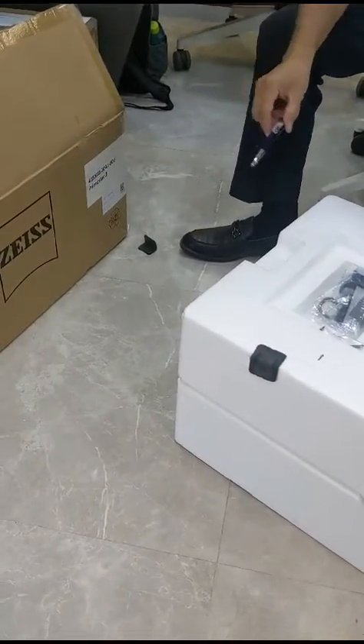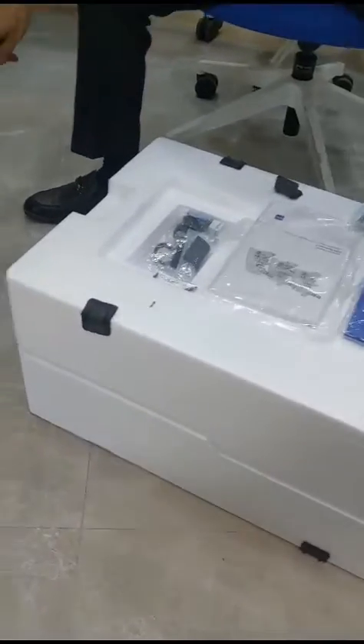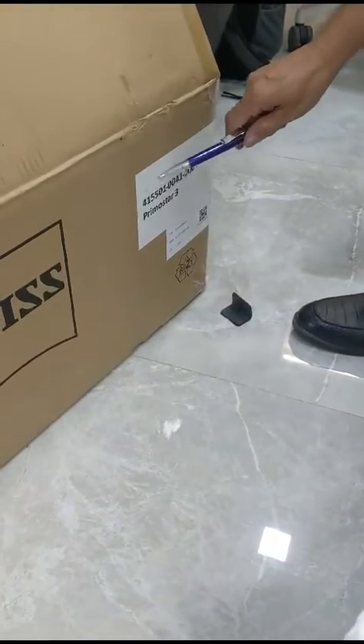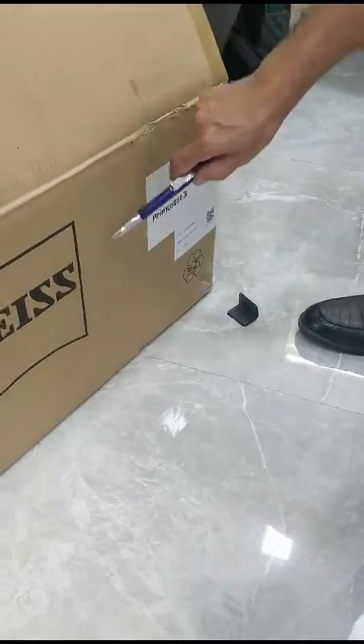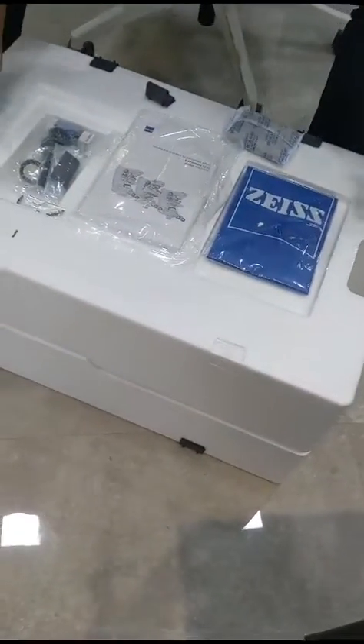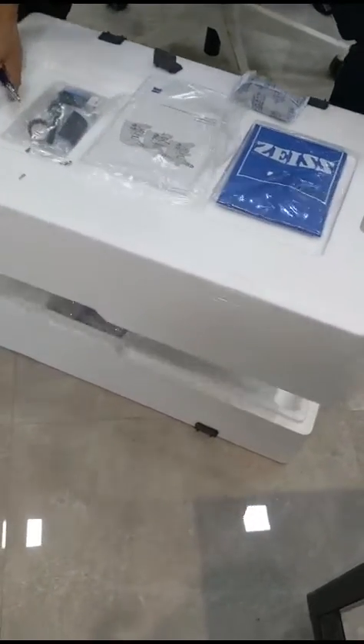We now demonstrate the installation of the Carl Zeiss Primostar 3 microscope. You can see the part number here. This is the main cardboard box. We have removed the microscope and kept it outside. Now we will show you how we install this microscope.